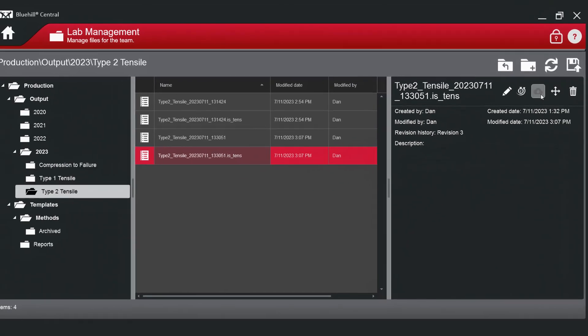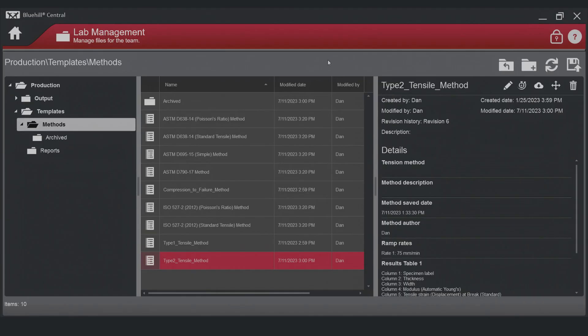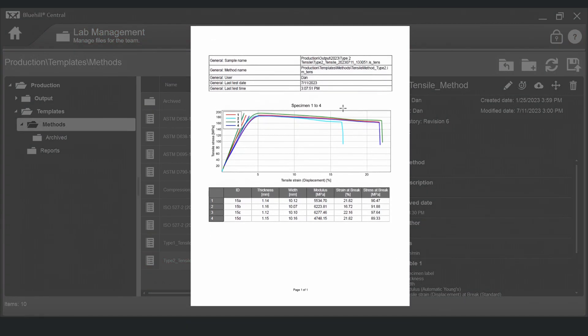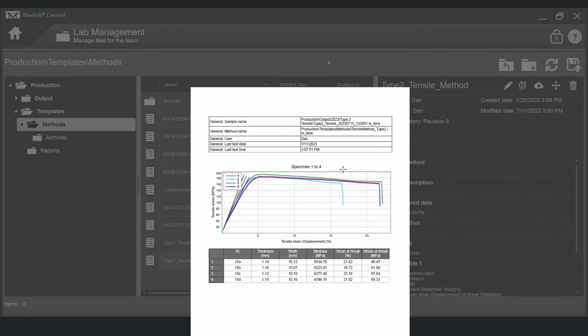Pressing the download icon will save the file to your computer's downloads folder. This can be useful when viewing or sharing test results.